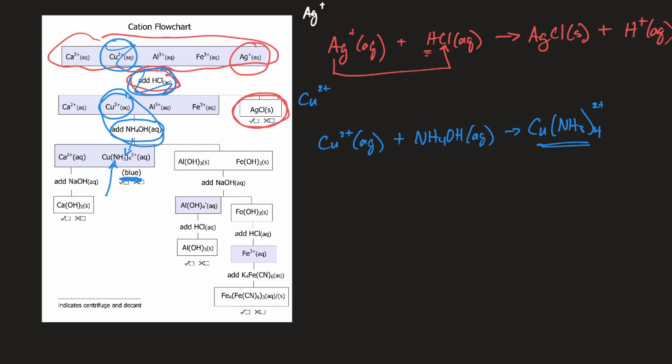But then I look back here and say, well, probably the only other thing that is left is that hydroxide. So maybe I'll just put a hydroxide here. Now this one was aqueous too, and hydroxide ion would be aqueous as well. Okay, and somewhere in your notes, just indicate that was blue, and that indicated the presence of copper.